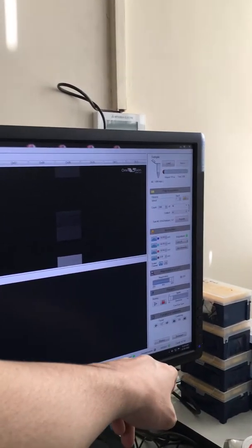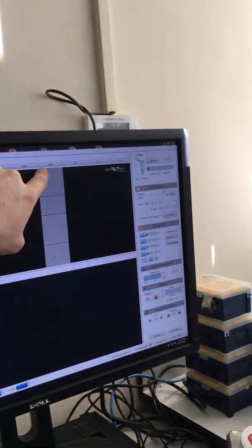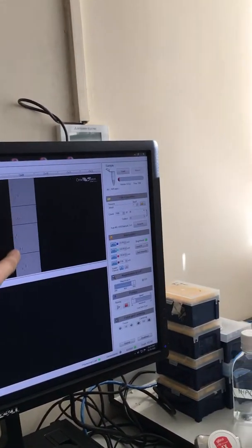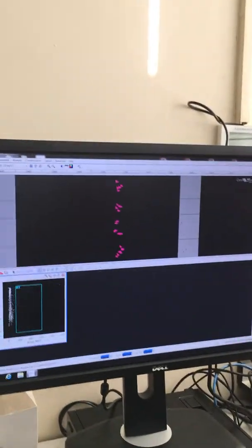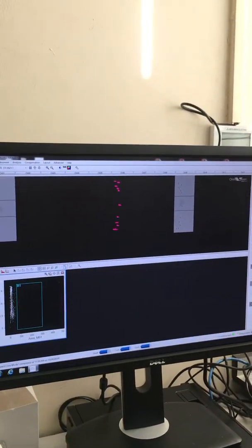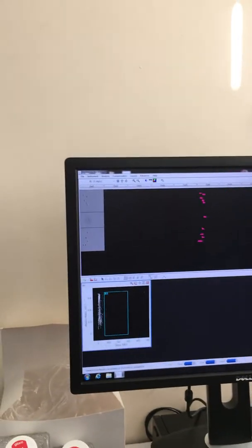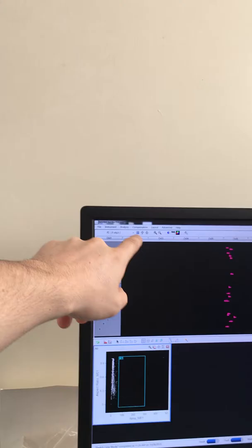Generally, every time you put a sample in, sometimes you'll see the cells appearing over here on the edge, and when that happens you need to center them, so press center that way, like 3 times. That will reset every time you load a sample, so you always need to press it to get the cells in the middle. And to acquire a sample, you just press load, but don't press load yet. We're going to do compensation first.